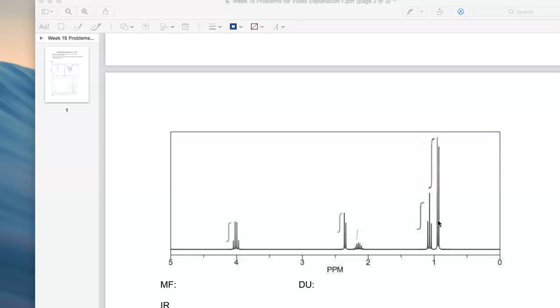So how we read the 1H NMR is by looking at the x-axis, which is in parts per million, just like the CNMR, and it shows us the chemical shift, which tells us how shielded the nucleus of a molecule is and the overall difference of the frequency between different groups. Then we can look at the spin or multiplicity, which is the number of peaks in each signal.